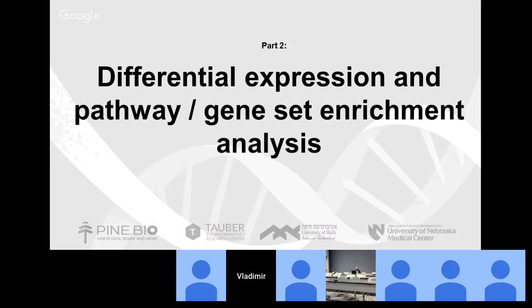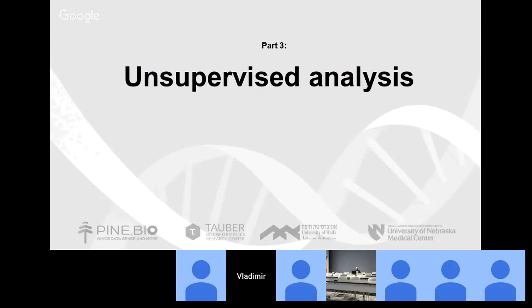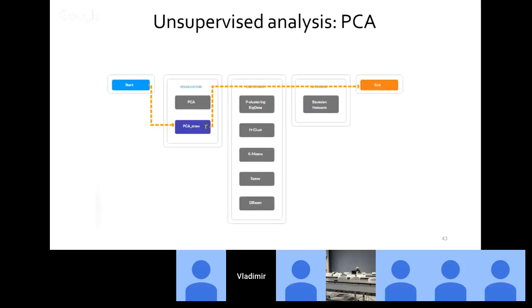If you see the presentation, just the title of... Yeah, the third part, part 3, unsupervised analysis. That's what we are seeing right now. Great, great. So let us go on.